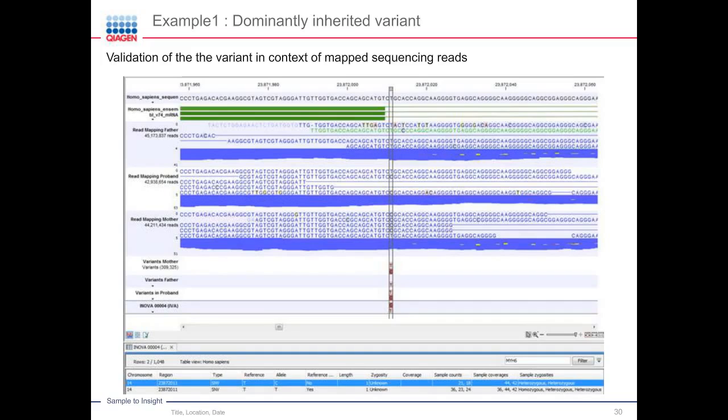And you can see that all the reads are mapped in blue, so that means they're in the distance which was expected, so mapped in pairs. And also there's no homopolymer stretch, they're not yellow, which means they are unambiguously mapped. So this is also something which you can trust.